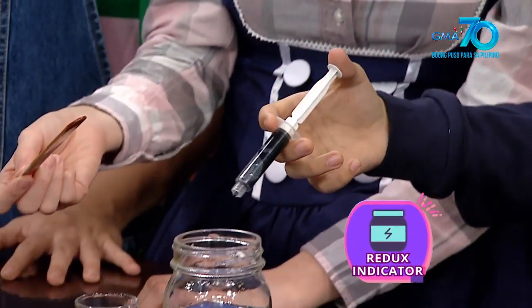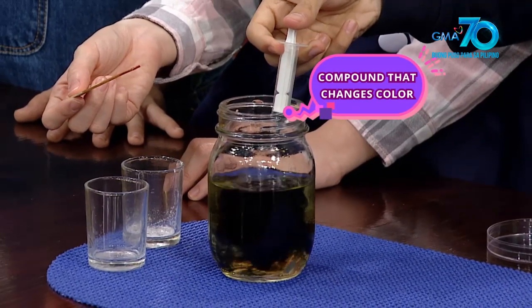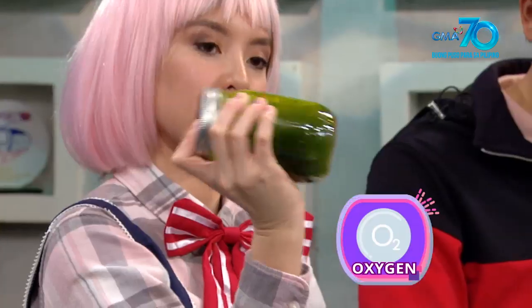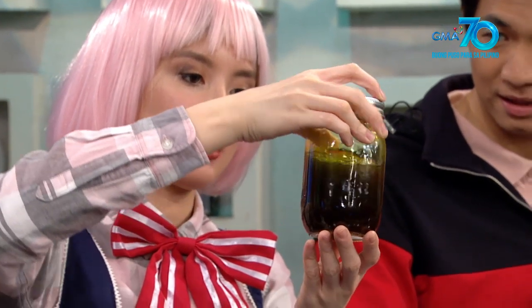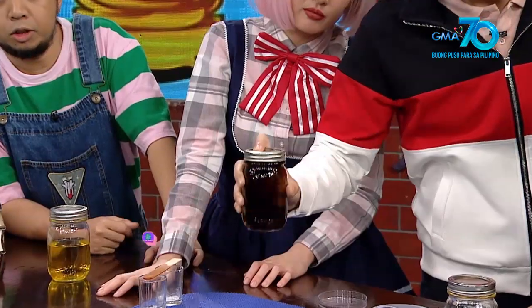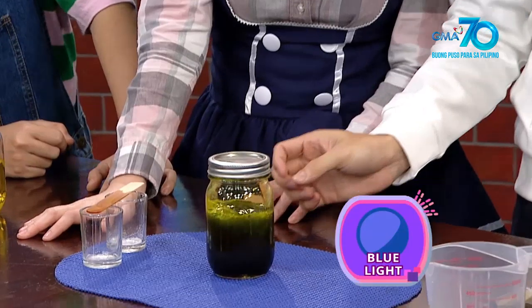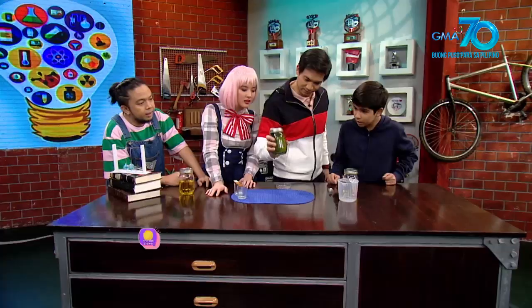Ang indigo carmine ay redox indicator. Isa itong compound na nagbabago ng kulay depende sa potential differences. Sa experiment na ito, glucose ang rason para magkulay dilaw ang solusyon. Oxygen naman ang dahilan kaya nagiging kulay verde ito, pero hindi direkta ang pagbabago — dadaan muna sa kulay pula. Sa umpisa, ang indigo carmine ay nasa reduced state. Nadagdagan ito ng electrons. Inaabsorb nito ang shorter wavelength of light gaya ng blue light kaya hindi makikita ang asol dito. Kundi nire-reflect nito ang yellow light kaya kulay dilaw ito.